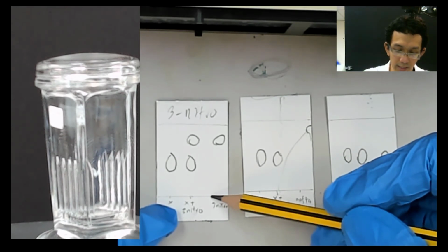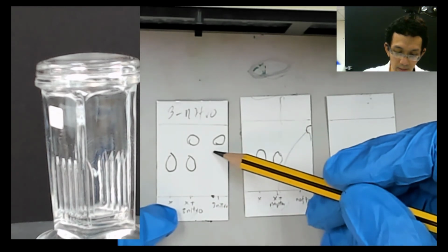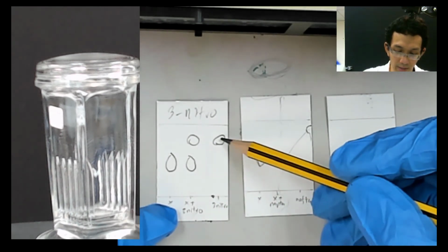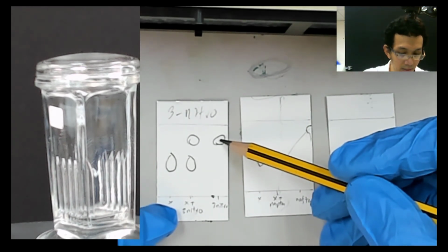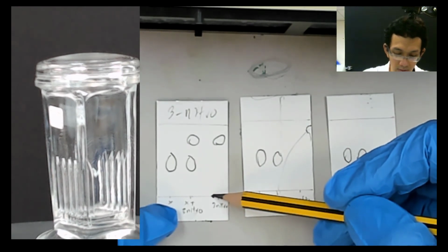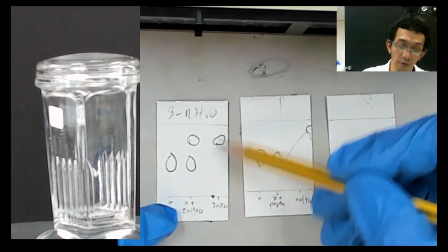Until the total distance is until what? From here up to the circle. Solvent front. So RF is the total distance by substance divided by the total distance by solvent. Total distance by solvent is from where to where? From here up until the line. Until the line, yes, because we are moving our solvent there.